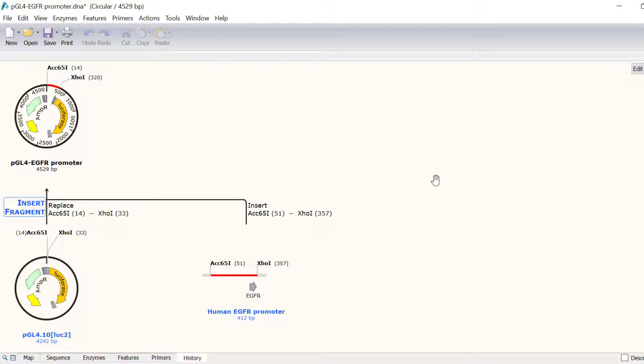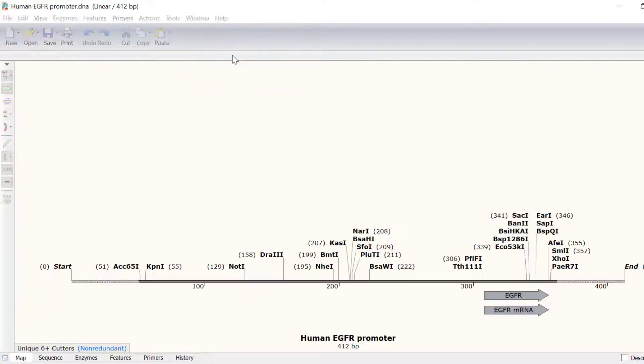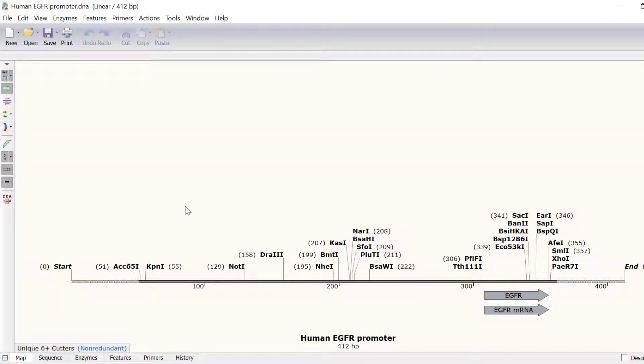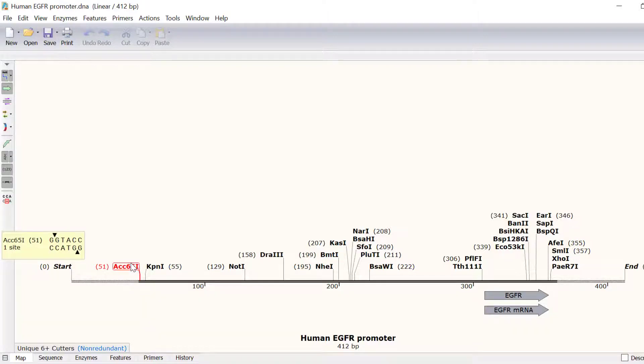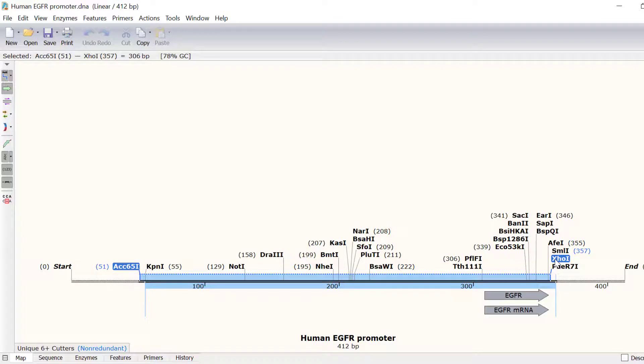With the file containing the insert of interest open, in my case this is the EGFR promoter, I will click and drag on the two restriction enzymes I will be using in the reaction. So again, this is ACC651 and XHO1. I will then click the copy button at the top.